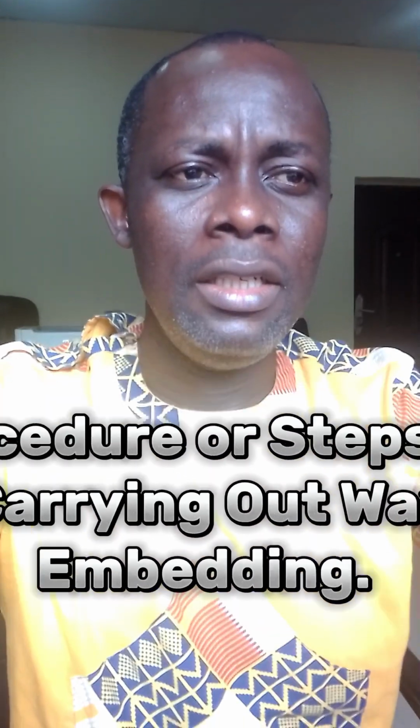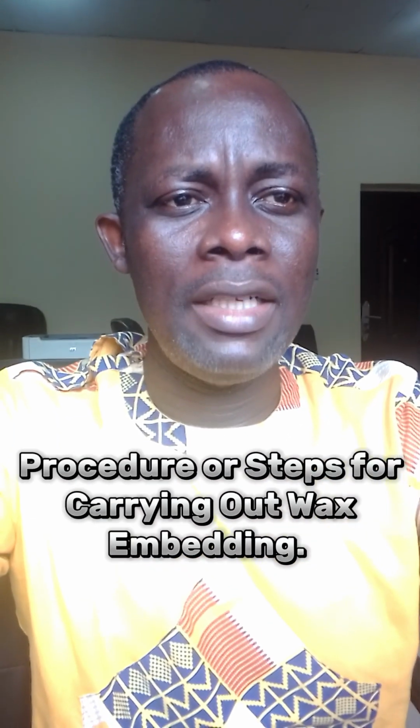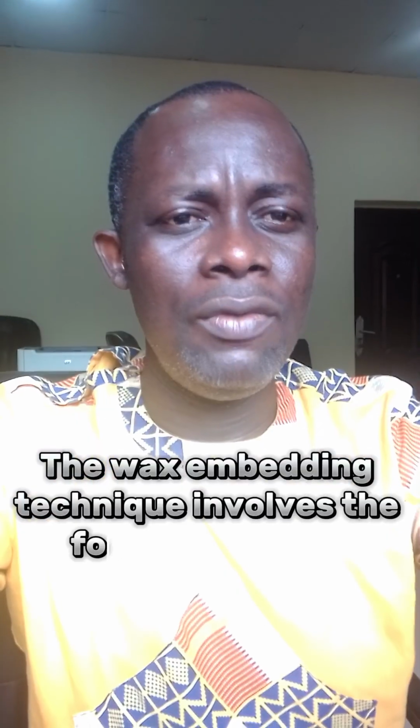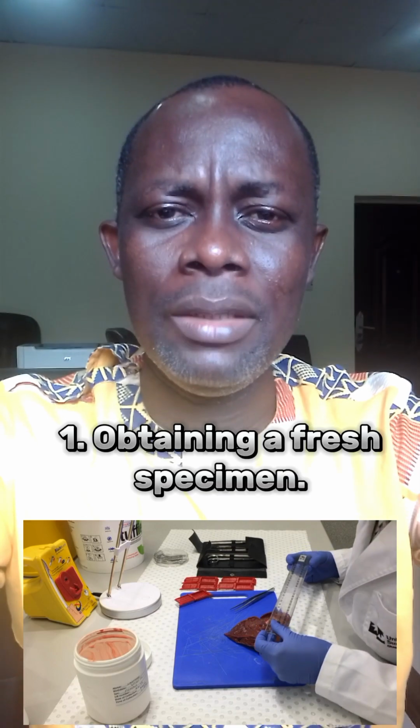Next, we want to look at the procedure or the steps for carrying out the wax embedding. The wax embedding technique involves the following steps. 1. Obtain a fresh specimen, and this involves the collection of plant or animal material. It could also be parts of animals or even humans, like the heart, the liver, the lungs, and even ovaries of females and other parts that are cut off during surgeries.